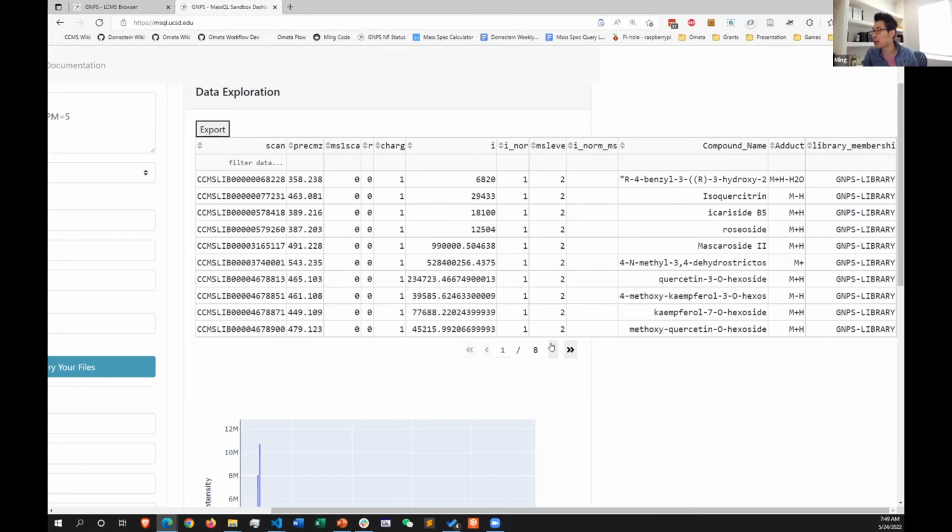And you have a question, can you search your own data? Yes, a lot of people search their own data. If you create molecular networks, you can do it on your own private data. So upload whatever you want, and you can enter these queries. You would have to run a workflow at GNPS. I'll send around documentation, but you can search one file, you can search 100 files at once, and you can go from there.